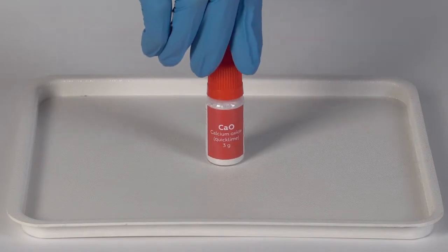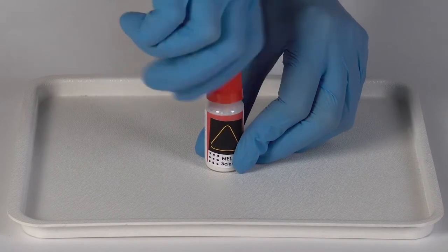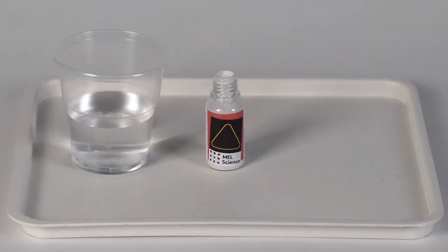Attach a yellow triangle thermosticker onto the bottle of calcium oxide. Open the bottle and put it on the plastic tray.